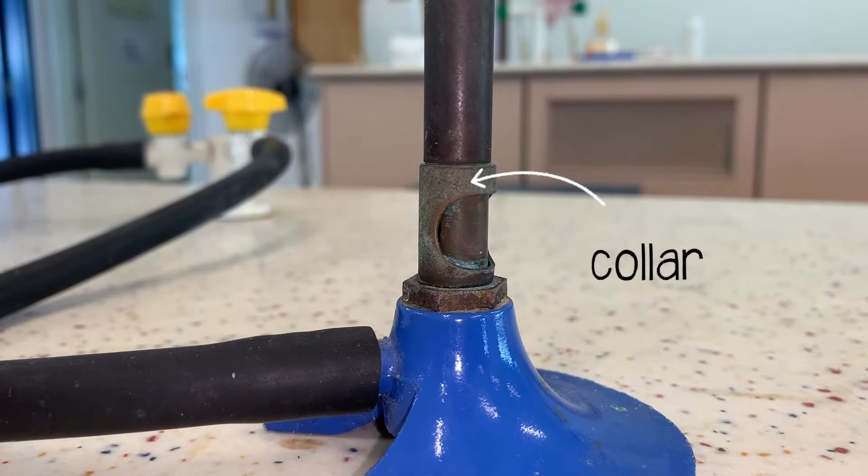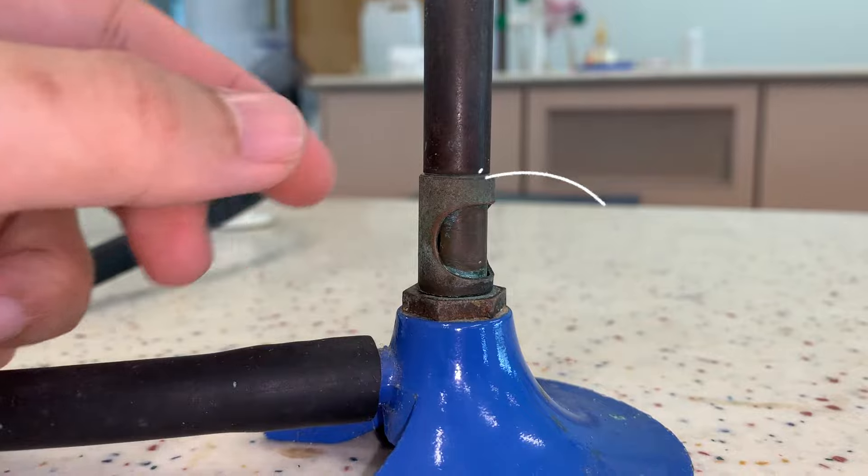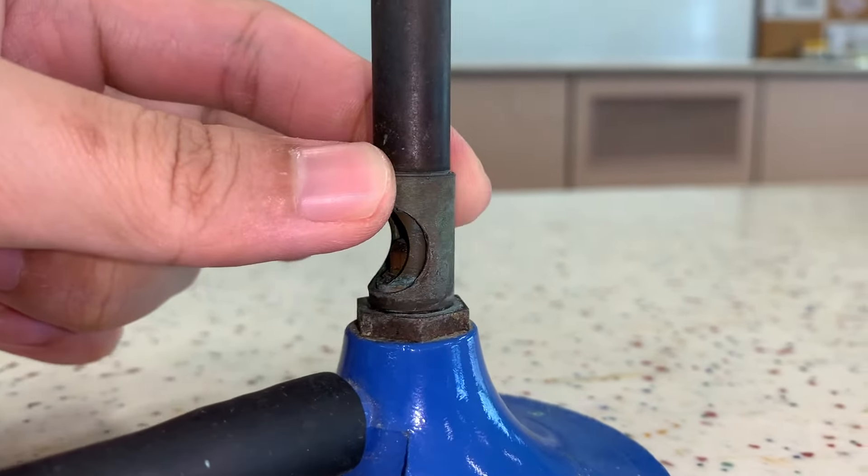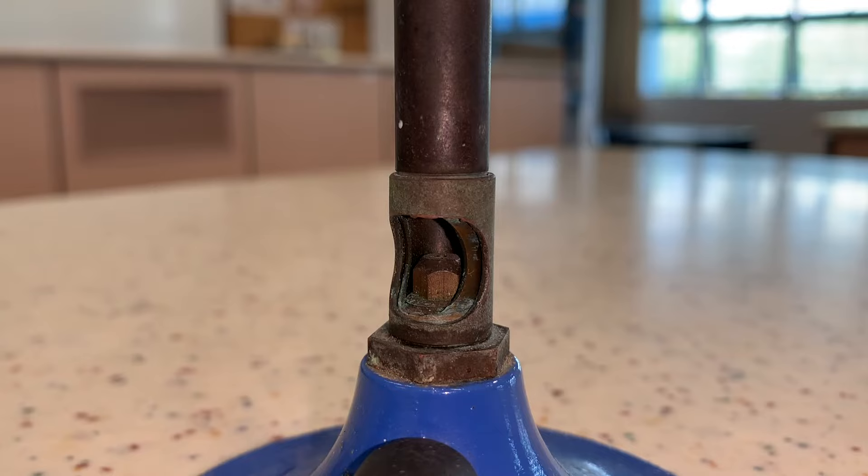The collar is a metal piece that can be rotated. It controls the amount of air entering the air hole. The jet enables the gas to rush out from the gas supply and to draw in air.